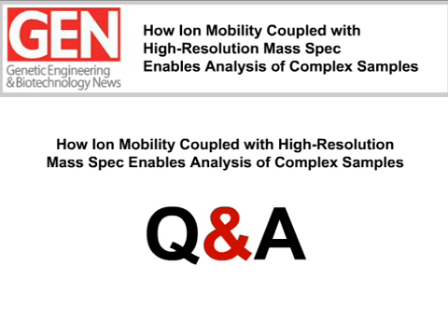But because you have these separations on the basis of different species and the separation of chemical noise, there have been reports, for example, I think David Plummer has shown some very compelling data where when you combine LC or GC on the front end of the IMMS, you can increase your dynamic range from about 4 or 5 orders of magnitude to about 7 or 8.